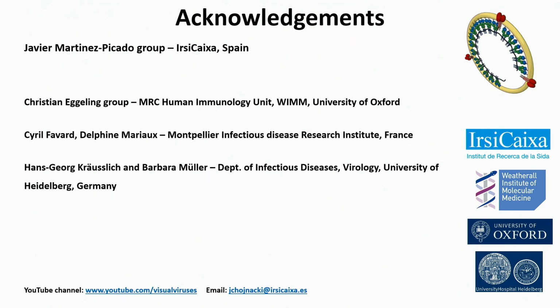Hi, good morning. Jose Martinez from University of Miami. Great talk. Thank you. Mind-blowing, actually. I wanted to ask you, if the breathing of the envelope, they say that it breathes between the open and closed conformation, would make any influence in your motility assay? And second, if the number of envelopes per particle will also make any influence, or if you tested that and saw many envelopes will move slower or the like.